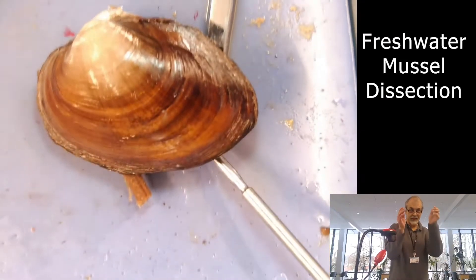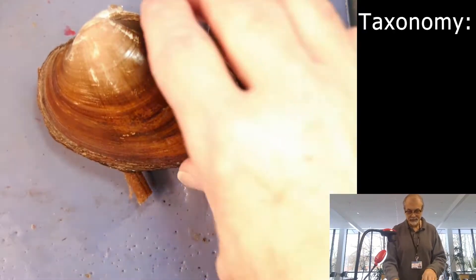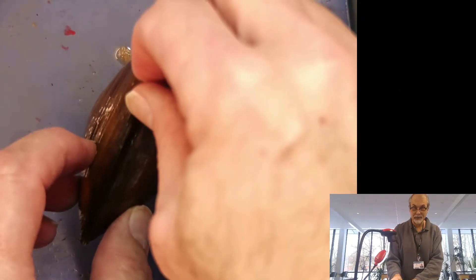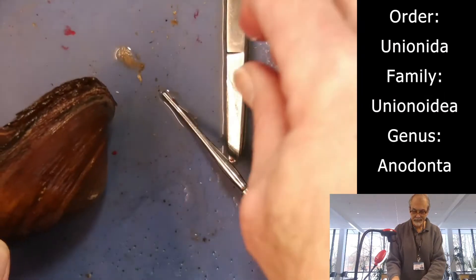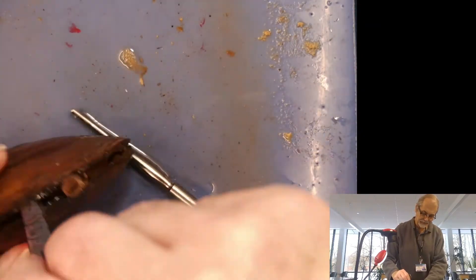A lot of people would see it and think it was a clam, because usually mussels are a little bit more elongated. But this is a mussel, and here's a piece of wood that's actually attempting to hold the shells apart so it doesn't totally seal. What you have to do is take some type of device and just begin basically working it back and forth like so.